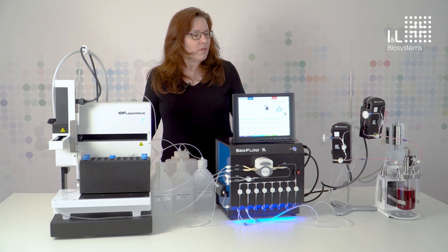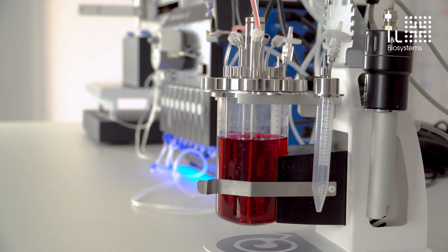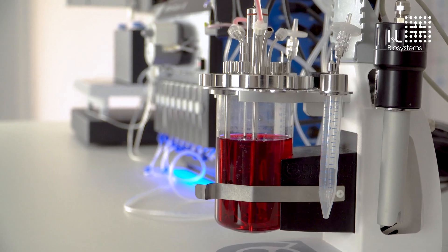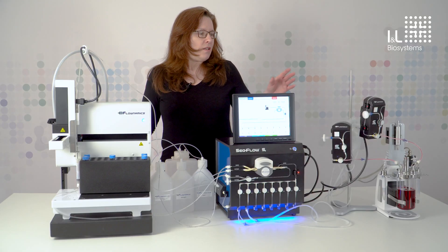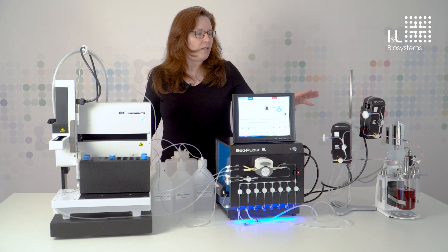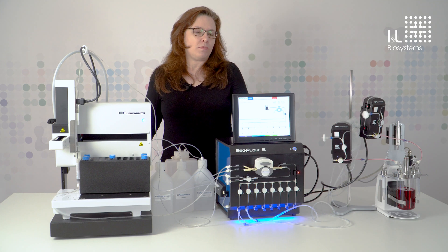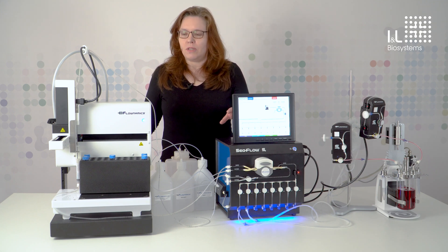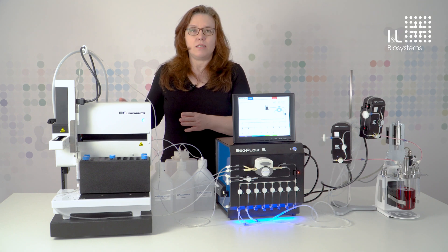The purpose of the system is to take samples from a fermenter during the fermentation process and forwarding them to the sampler. It consists of several components: connections directly on the fermenter, the main unit right here, and the respective analysis systems or in this case the sampling station.